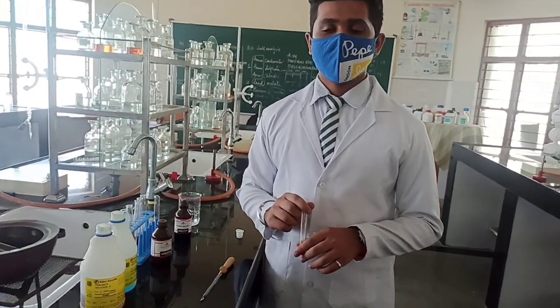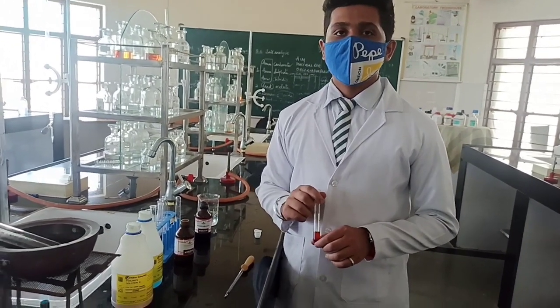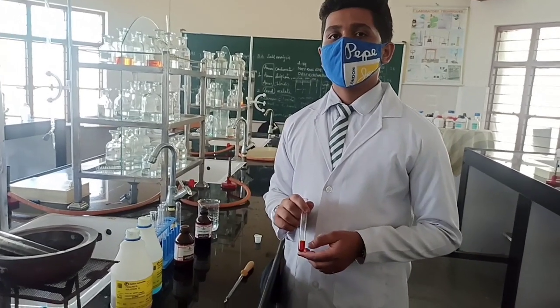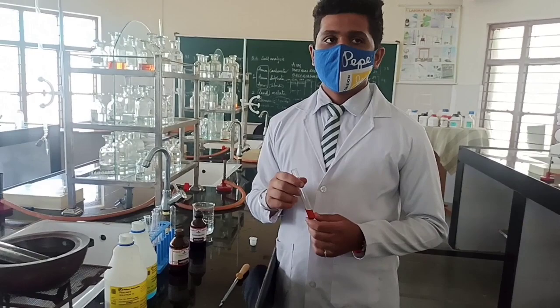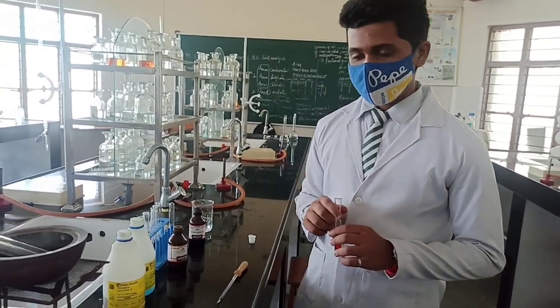We have performed 3 confirmatory tests: Schiff's test, with which we got pinkish magenta color; Tollens reagent silver mirror test; and Fehling's A and B solution, with which we got a red precipitate by heating in the water bath. Thank you so much.